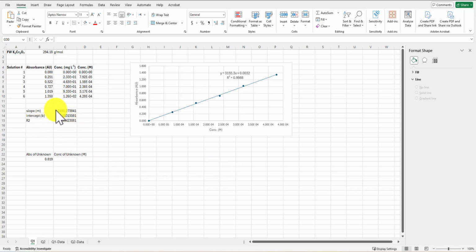Okay, so why this is really handy to have in this format directly is now, if in our measurement, which we often do, we have a data point where we measure the absorbance of a solution, a colored solution, but we don't know its concentration, and it comes out as 0.819. We know that falls somewhere in between our lowest and our highest. It must land somewhere here, which means its concentration is somewhere here. But instead of just guessing from the graph, we can solve directly. So this is a y value. We can plug in for y here, and then we can solve for x.